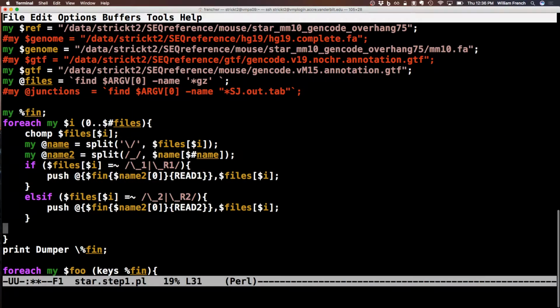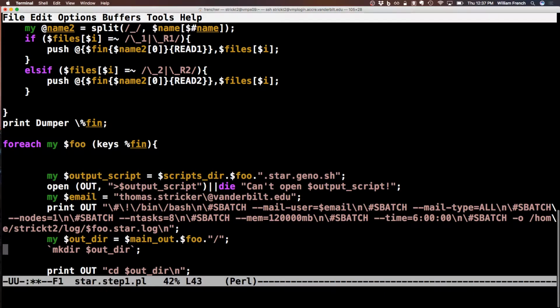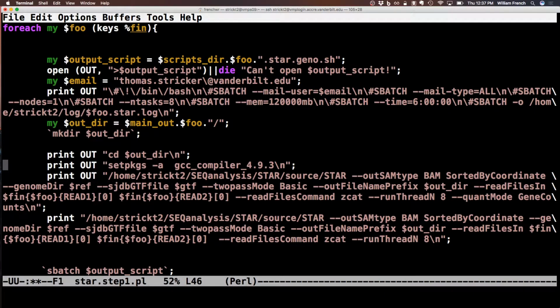So then this is a paired end experiment. I have a little piece of code here where I'm going to find all of my sequencing files. I'm going to go through each of those sequencing files and make a hash of hashes where the first key is my sample name extracted from the file. And the second key is whether it's read 1 or read 2, provided it matches the two ways right now that Vantage encodes reads. If they change the way they encode reads, I have to fix my code, and I really hate it when they do that, but they do it every once in a while, and you just have to deal with it.